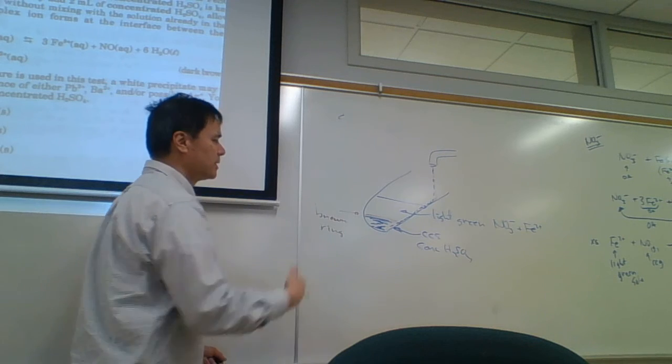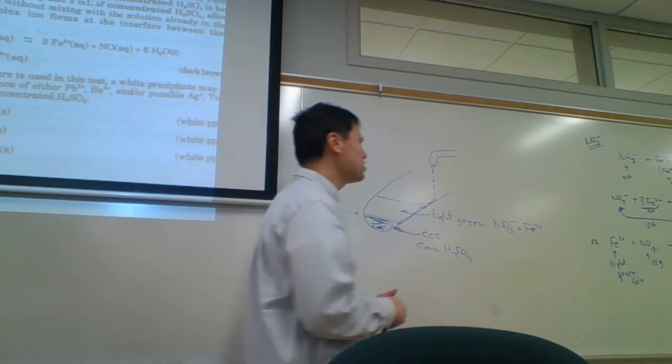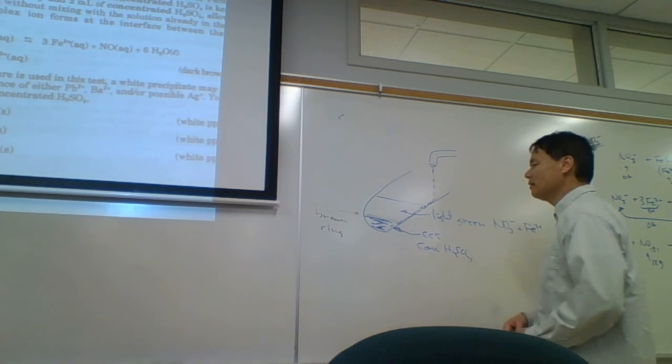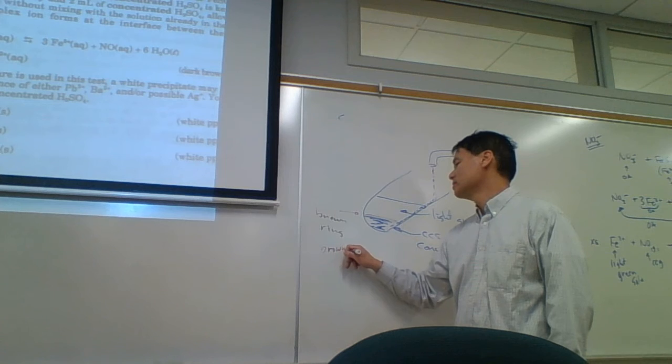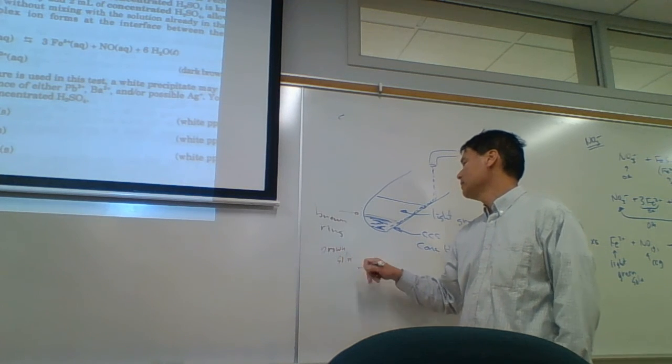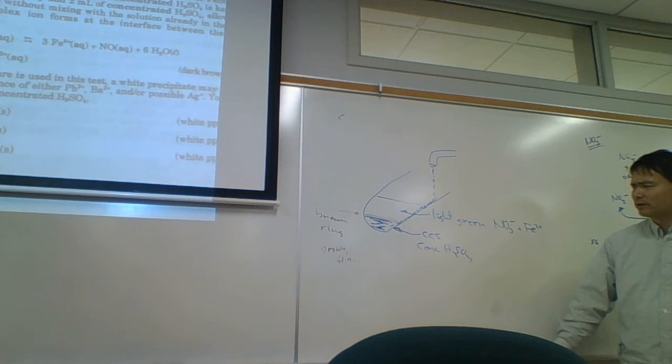Of course, if you mix it up, then good. And so what we're looking for is a brown solution. Not a precipitate, but a brown solution, a liquid layer right at the interface there.